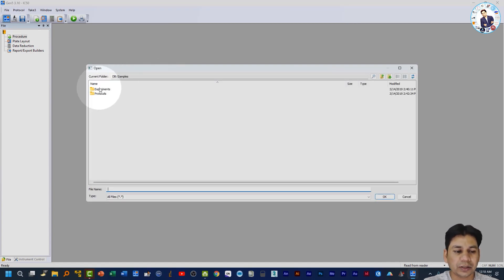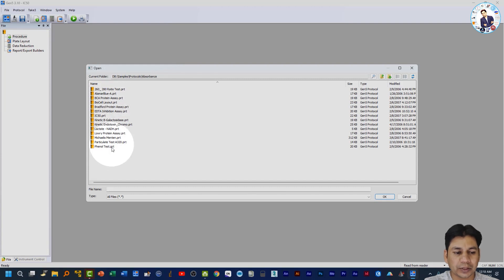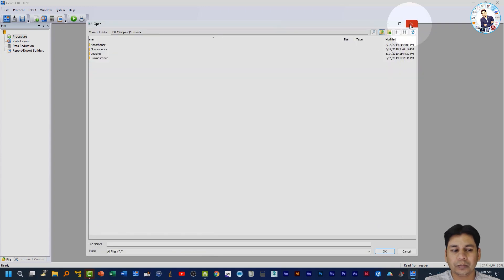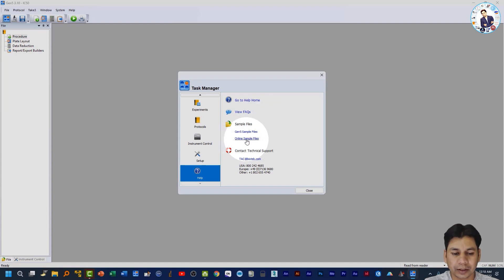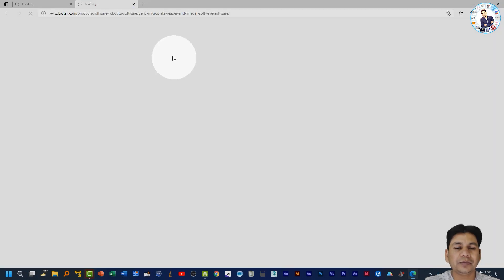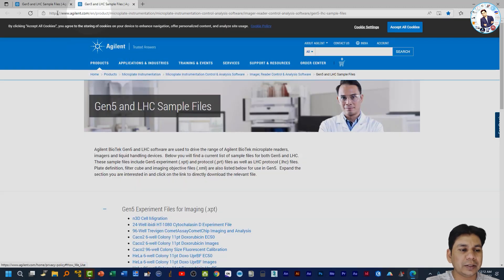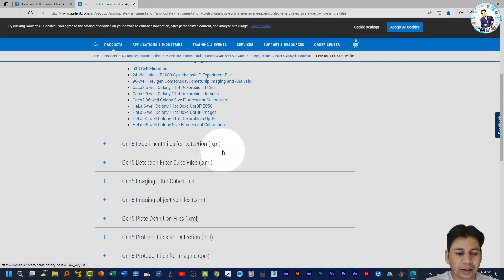From the Task Manager you can get the sample files saved in your system for both experiment and protocol. If you click on Protocol, you can see there are many protocol files present for Absorbance and also for Fluorescence. These protocols are also available online — if you click on 'Online Sample File,' it will open a direct link where you can get experiment and protocol sample files from agilent.com.